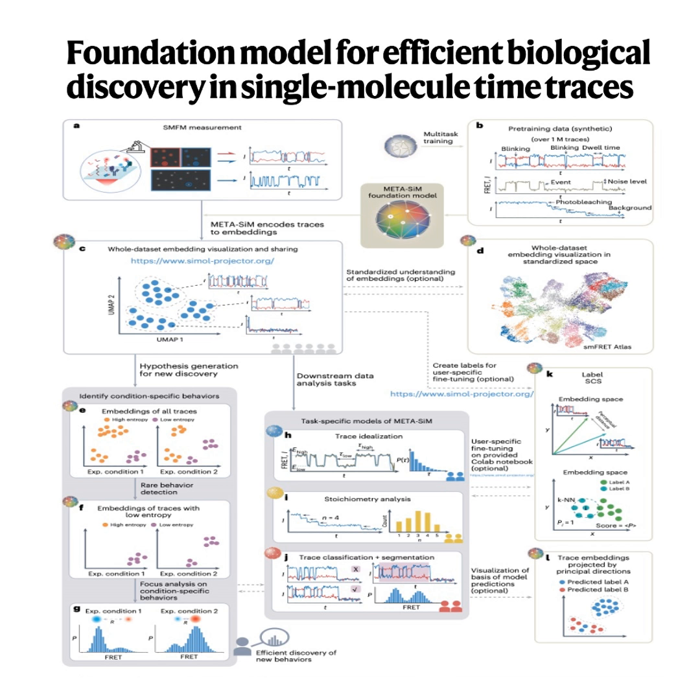Today we're tackling something really central in molecular biology. How do you find that one crucial insight, that needle of truth, buried in thousands of complex, messy data traces? It's a huge challenge, especially with single molecule fluorescence microscopy, or SMFM. It's an amazing technique, don't get me wrong. Oh, absolutely. Revolutionary, even. It lets us watch individual molecules doing their thing in real time.